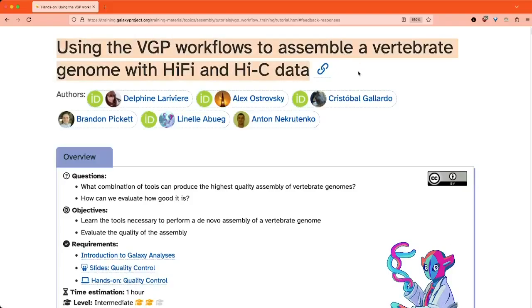This tutorial is aimed at using the workflows we have, which are a set of modular workflows you can plug and play with your own data or with the test data. These workflows chain together the tools covered in depth in the long-form tutorial, making the process more automated and more feasible to do with your own data. These are the workflows actually used in production by the VGP to generate high-quality de novo reference genomes.